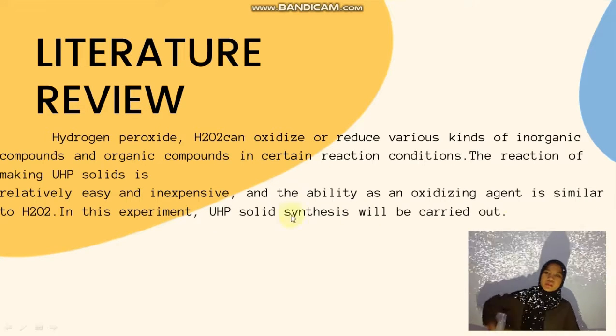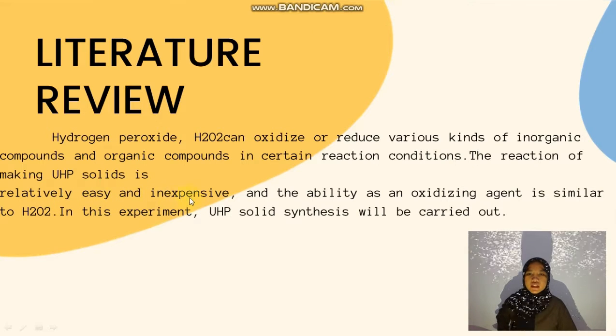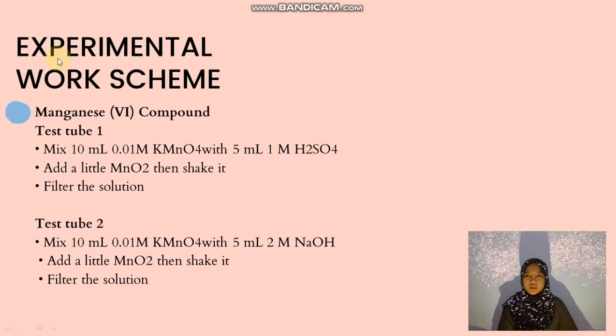Literature review. Hydrogen peroxide H2O2 can oxidize or reduce various kinds of inorganic compounds and organic compounds in certain reaction conditions. The reactions of making UHP solids is relatively easy and inexpensive, and the ability as an oxidizing agent is similar to H2O2. In this experiment, UHP solid synthesis will be carried out. Next, experimental work scheme.